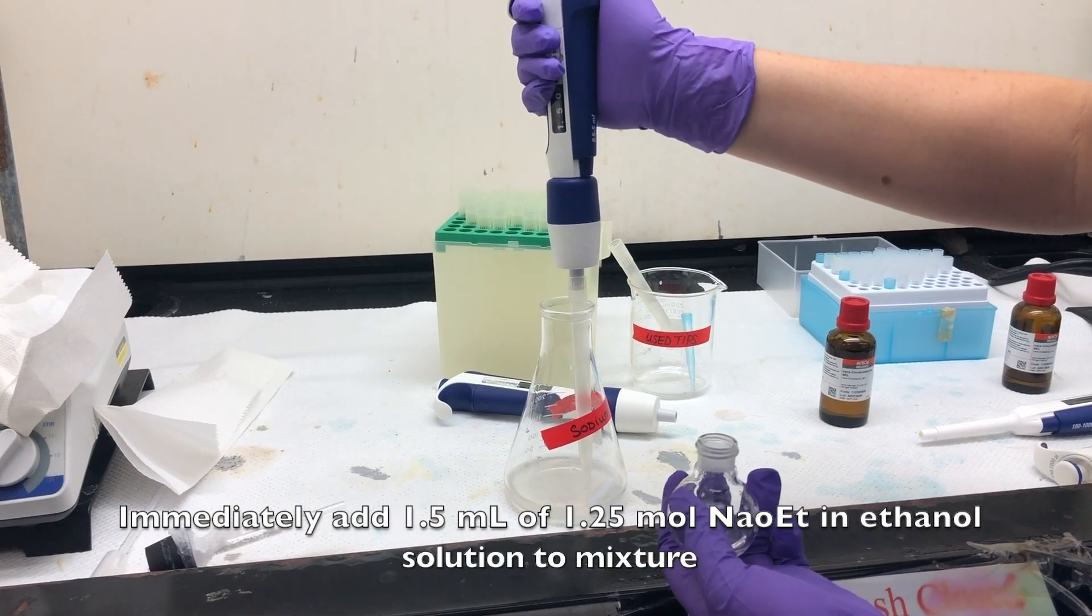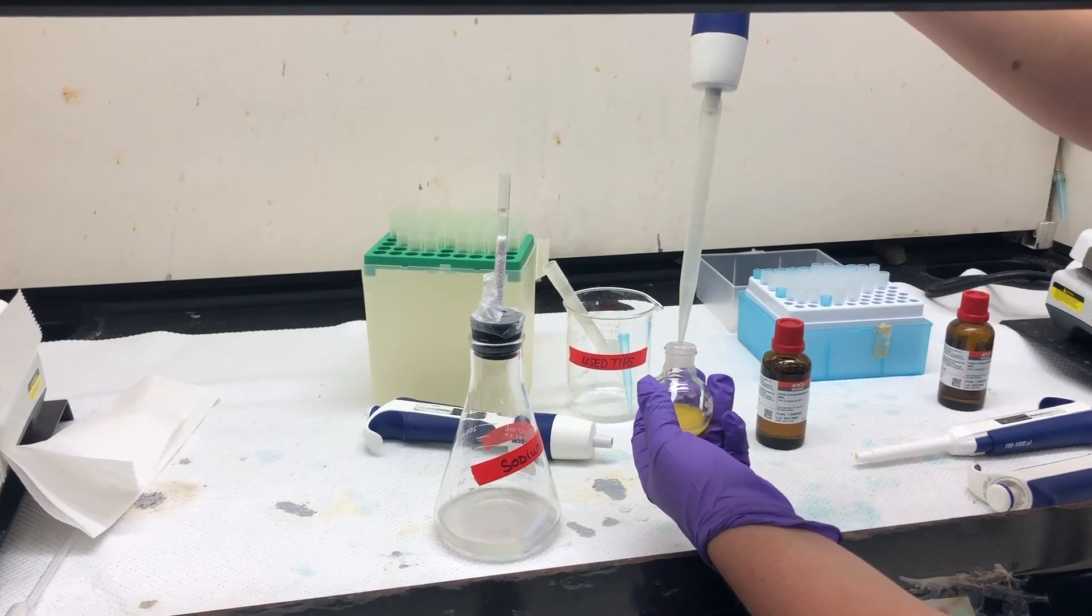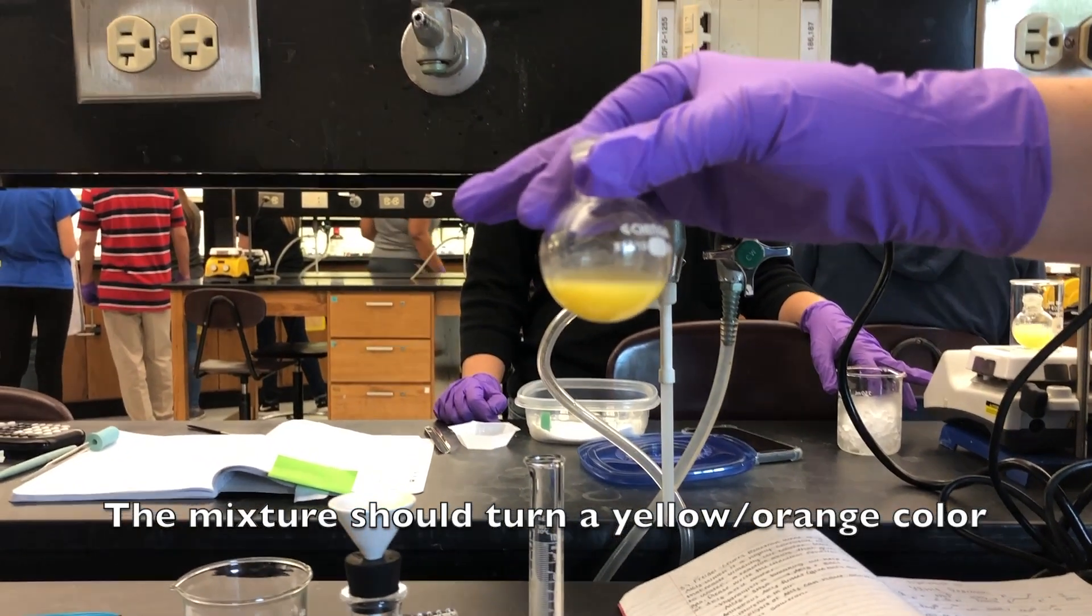Immediately add 1.5 milliliters of sodium ethoxide in ethanol solution to the mixture. The mixture should turn a yellow orange color.